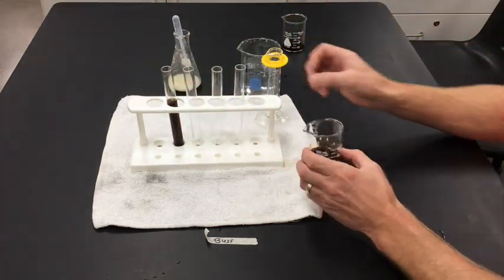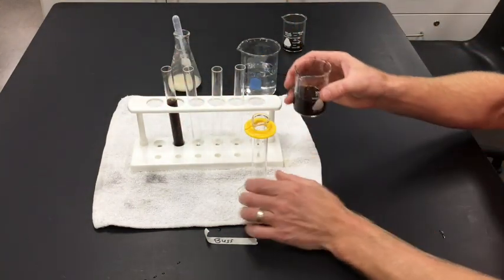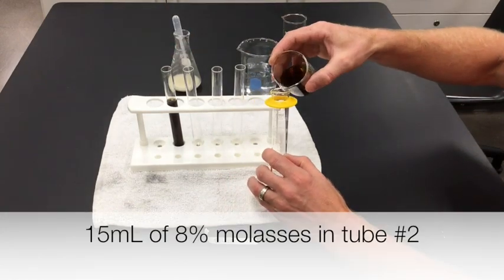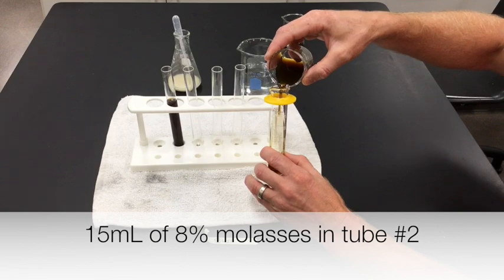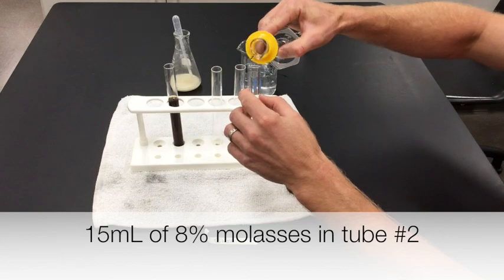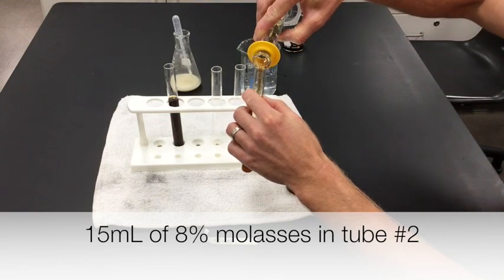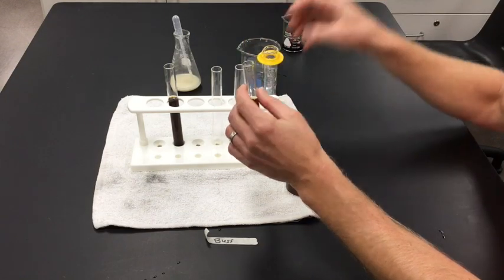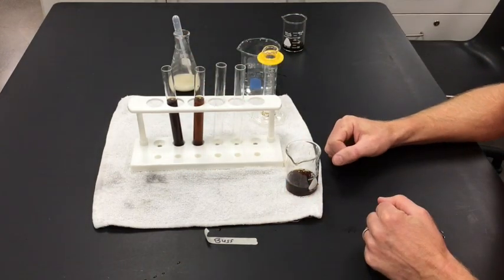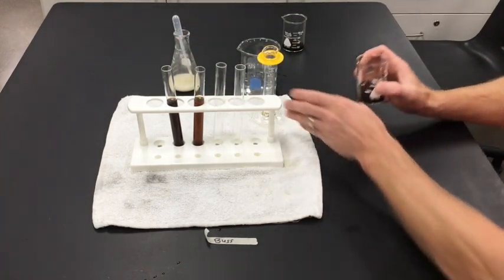Mix that up — so that is half the concentration. I can't add it directly to the test tube; I need to measure it out, and the same amount goes into each test tube: 15 milliliters goes into every test tube, just at a different concentration. So 15 milliliters of my first dilution goes in — you can see it's a little lighter color.